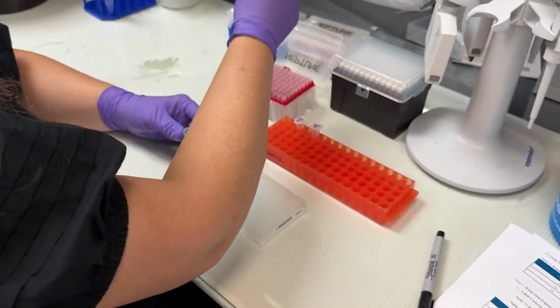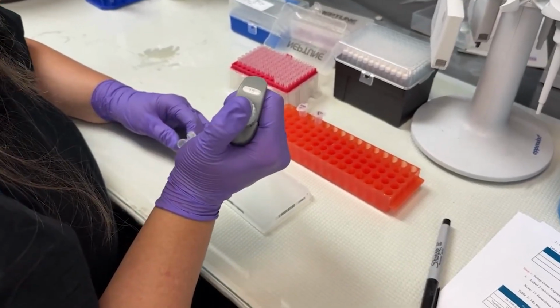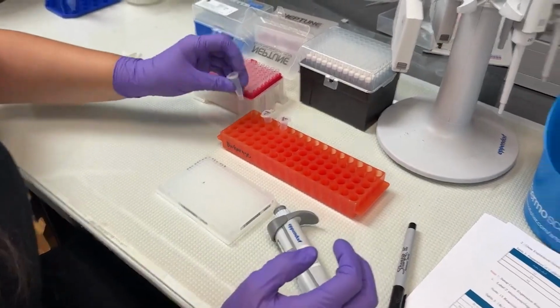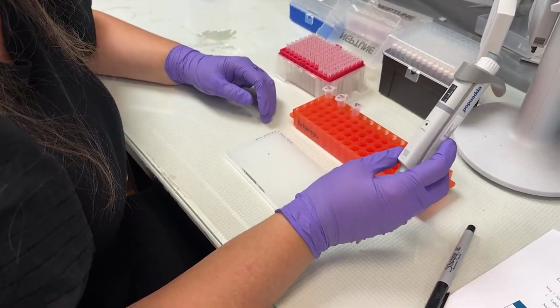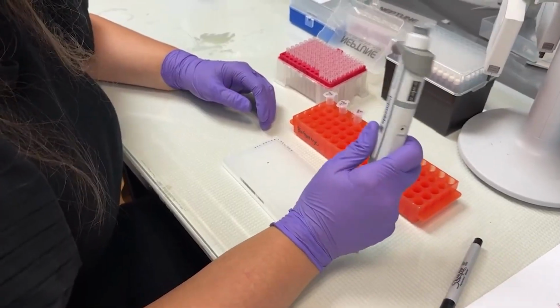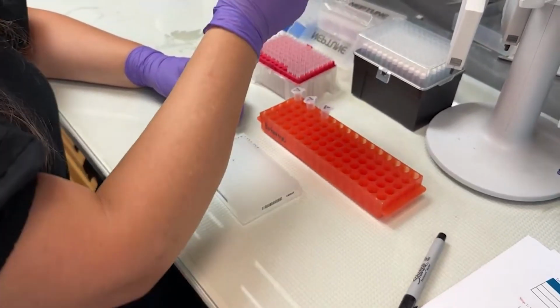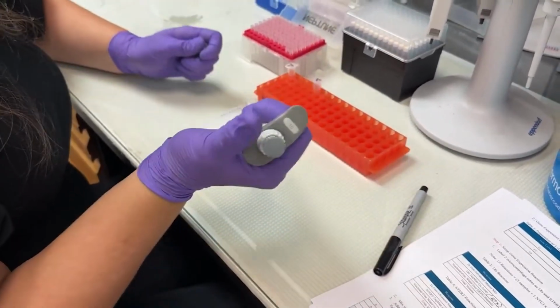And I don't know how you guys do about calibrating your pipettes in your labs, but I was never very good about it. So if there's anything wrong with your pipettor, you're going to have more problems at 1 microliter than you will have at 2. So I like to recommend 2 microliters just to be consistent and accurate. Okay, so that was sample 1.